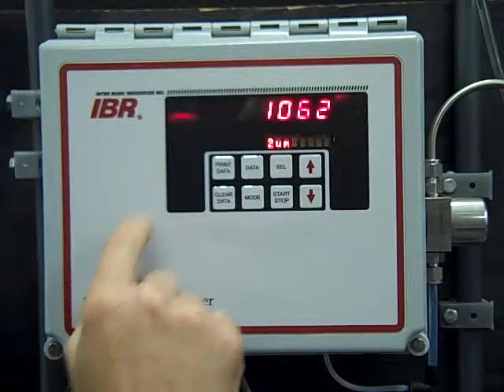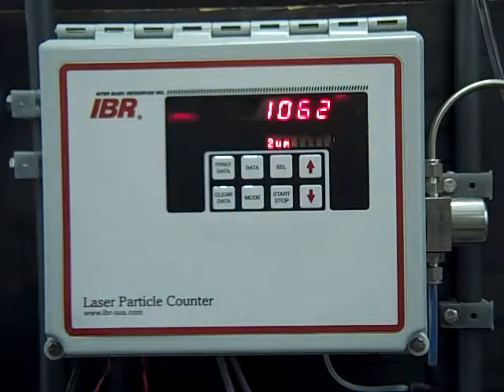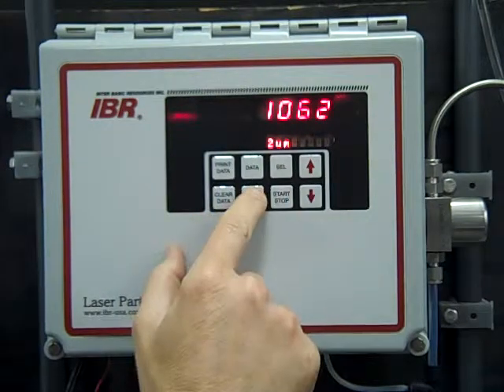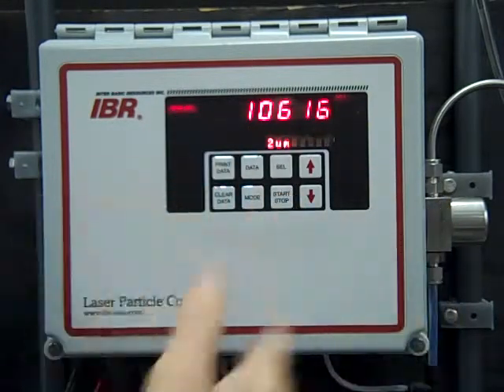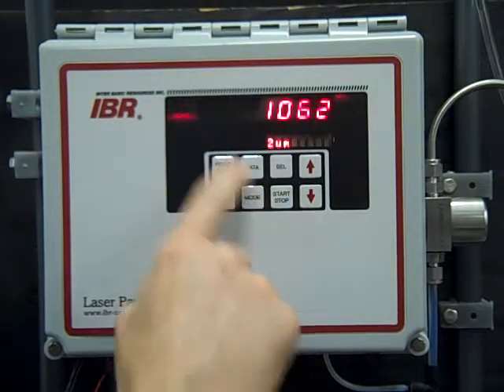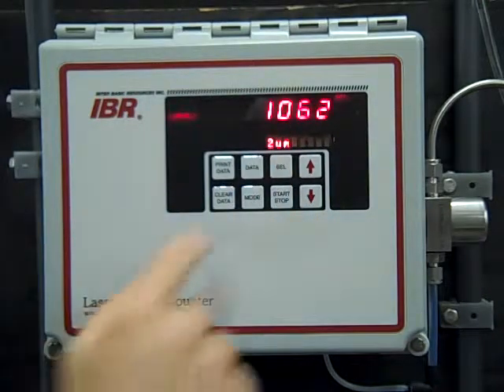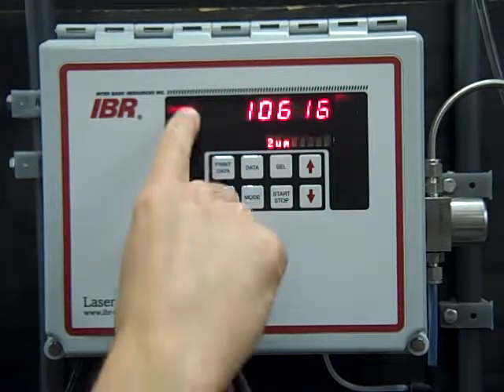count display. The counts per ml is probably the best setting to have the particle counter set to. Total counts will change too often and you can't look at it and know what the counts are. Setting it to counts per ml will be a more stable number. So that's the way counts per ml is determined from total counts.